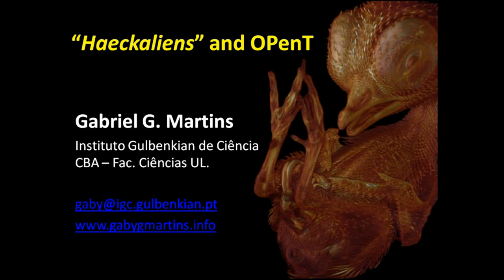So the title of the talk is kind of strange. I'm aware that many of you may have started using optical projection tomography a long time ago, even before I realized what it is. I came across it a few years ago and immediately realized that it was a technique that I'd like to have. The problem is, you're probably aware that the economic situation here in Portugal has been complicated, and it was tough to get financing for research. So what I actually did, encouraged by my colleagues and by the inventor of optical projection tomography, was decide to build my own system.